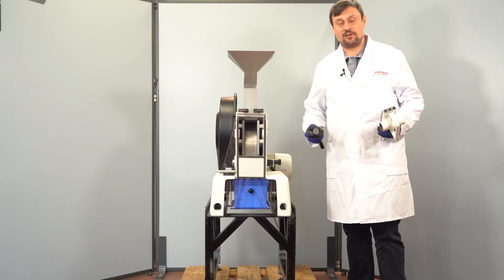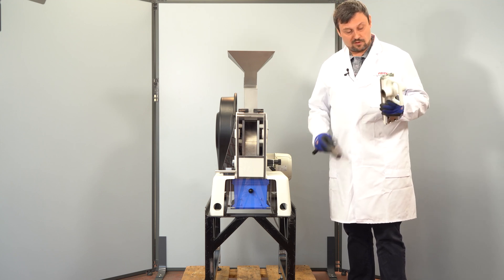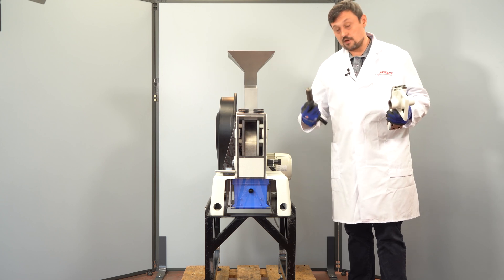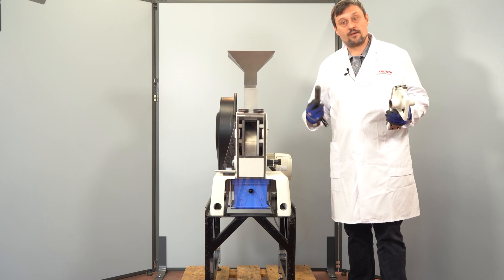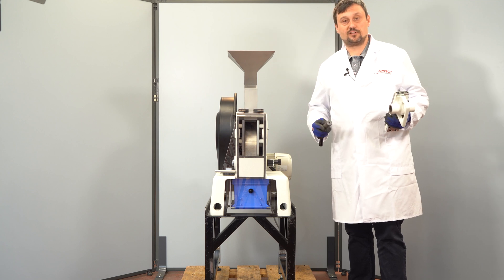Now we want to prepare the instrument for grinding. For this we have to mount the fixed jaw into the instrument. I will show you how to do that. When you receive the instrument it will be set up as required.